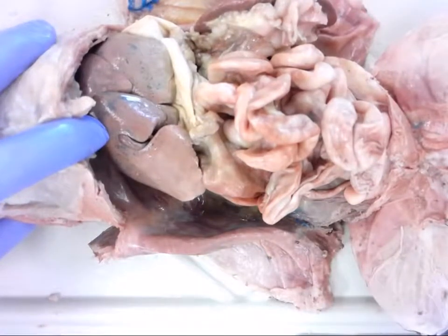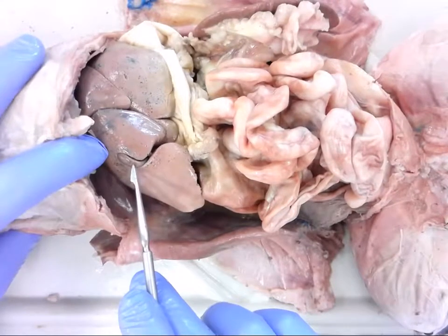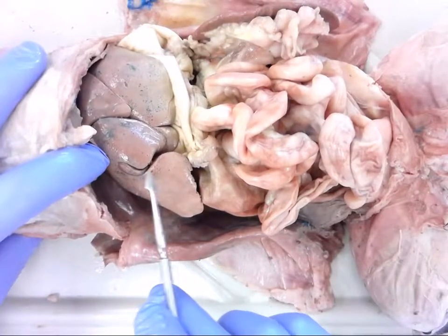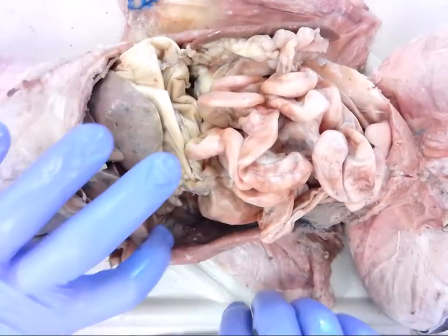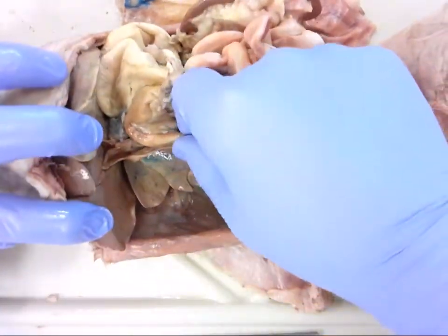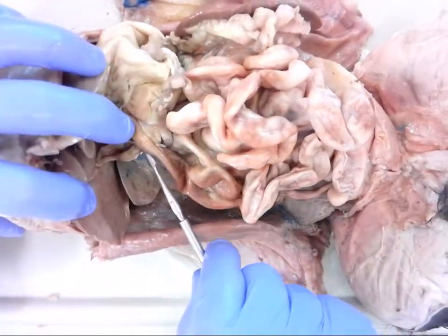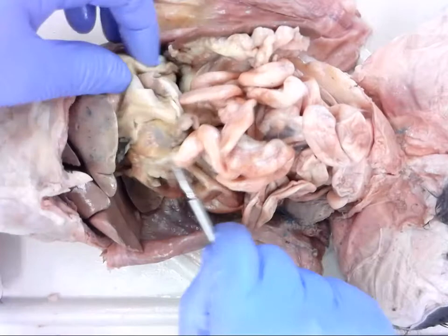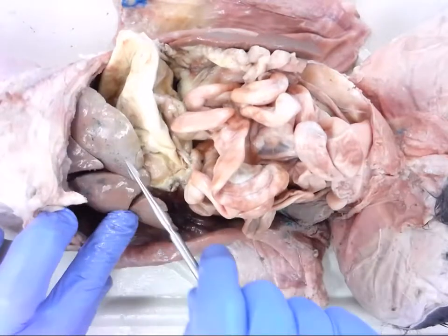What you'll see sitting right inside the liver, right here, is a small little pouch called the gallbladder. If you remember back to our digestive unit, the gallbladder stores bile, and bile is then released through the bile duct. It's kind of hard to find some of these ducts, but this one is not bad. You can see it right down in here, and it goes into the duodenum. That bile is going to help neutralize some of the acidic contents coming from the stomach. All right, so that is our liver.